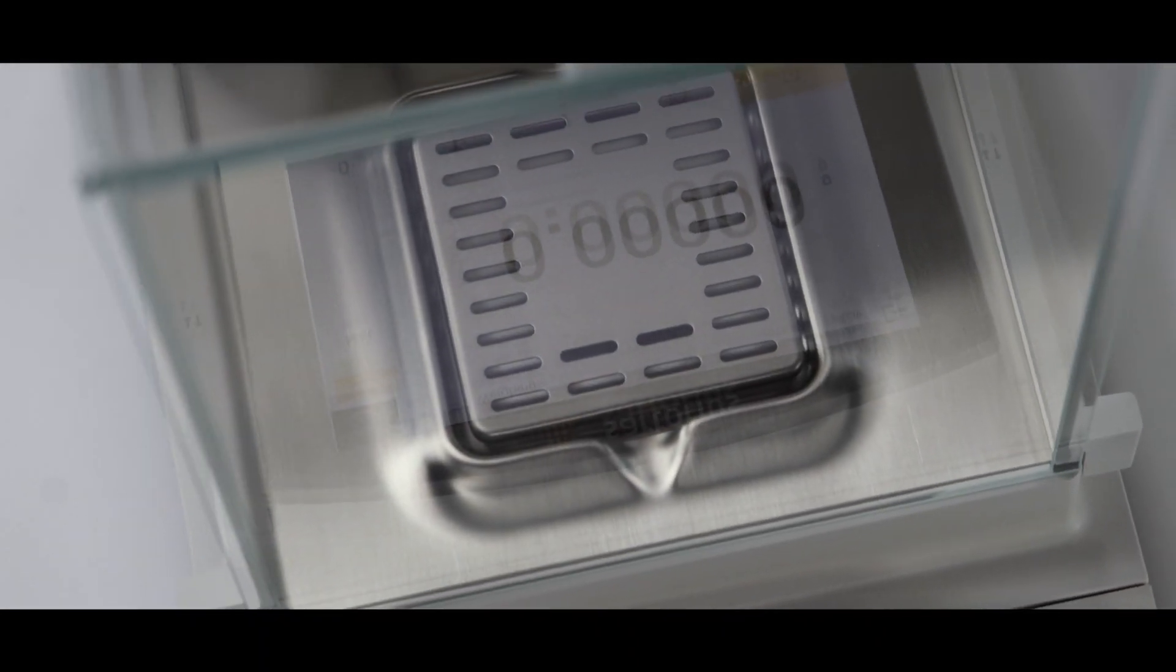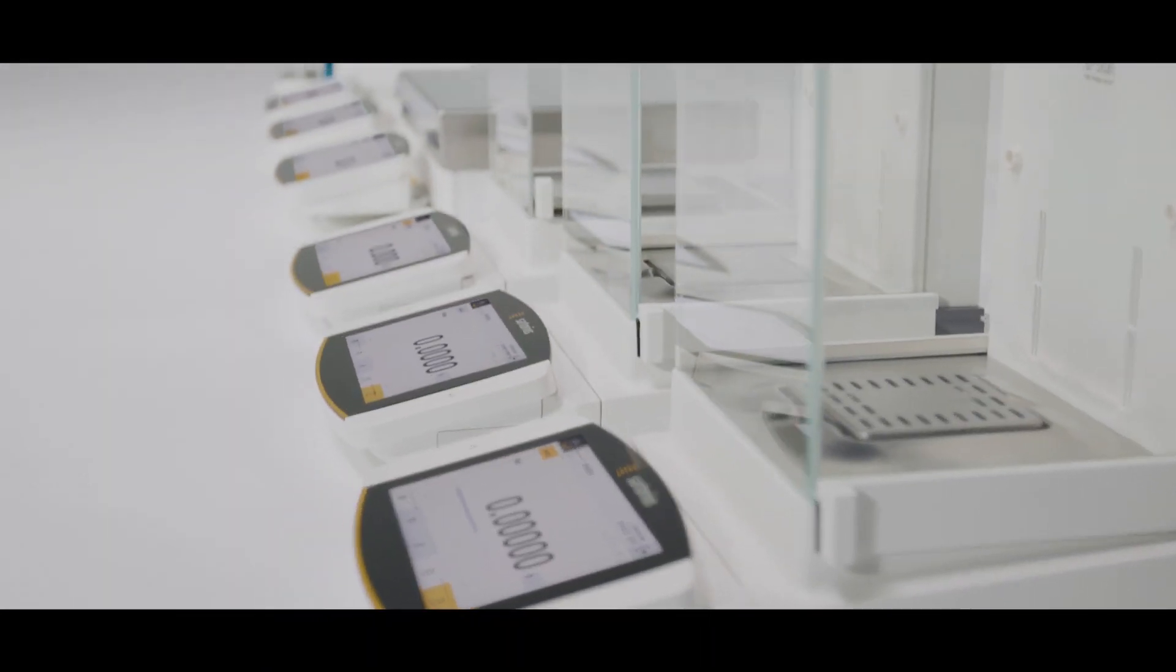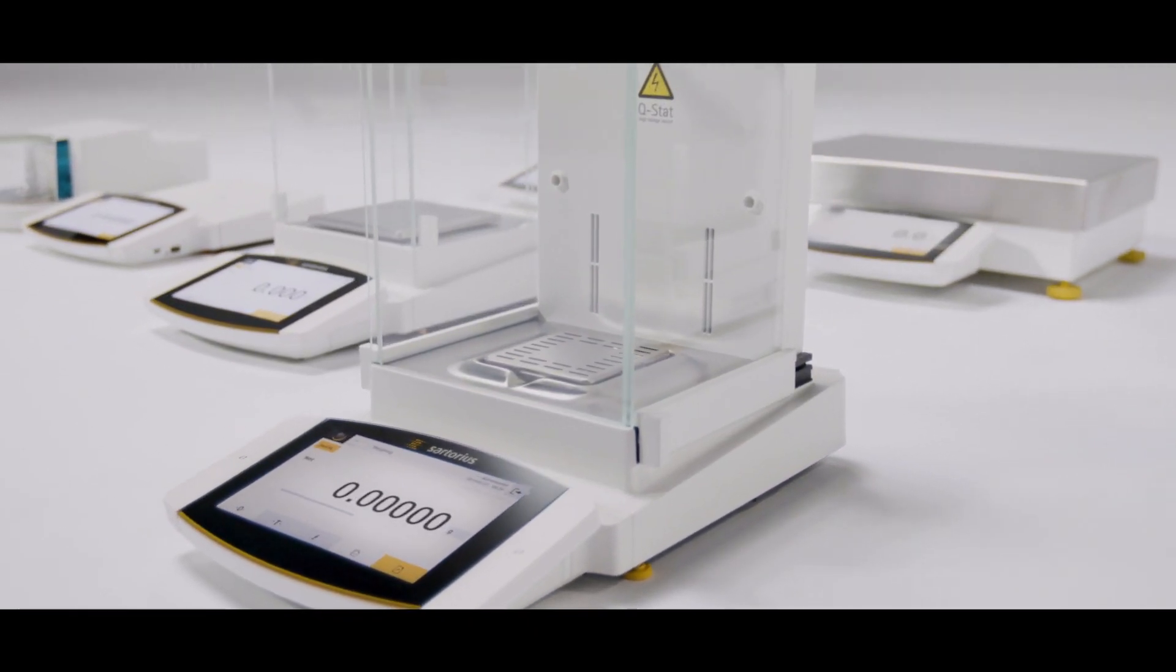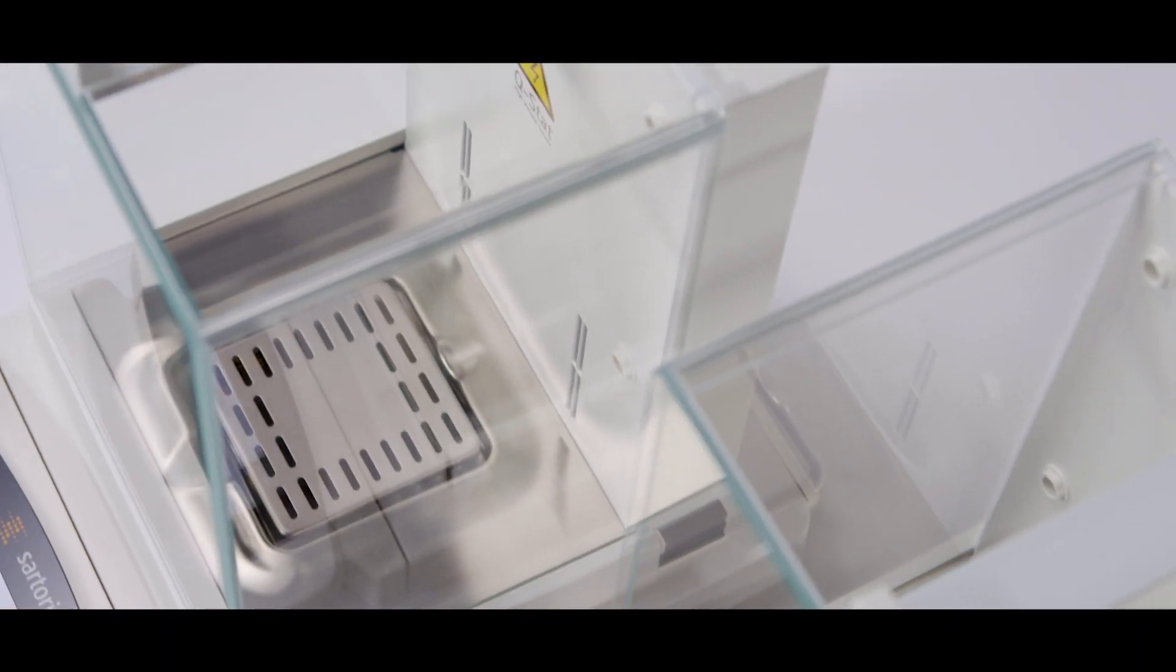Thanks to state-of-the-art engineering technology, Cubis II is not just a balance, it's the key to a completely new dimension of possibilities.